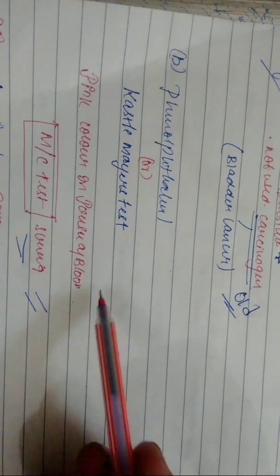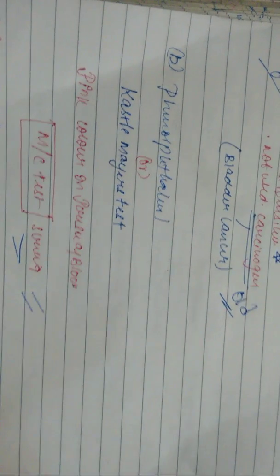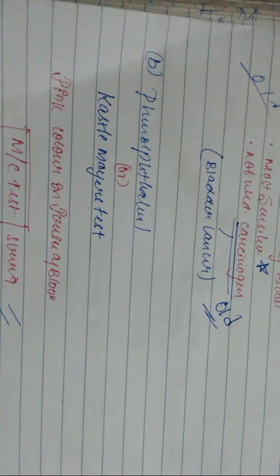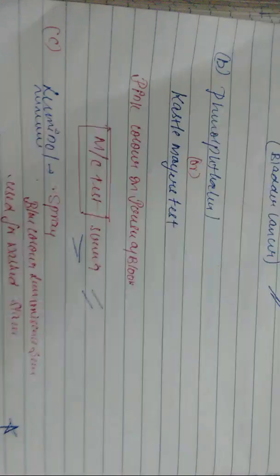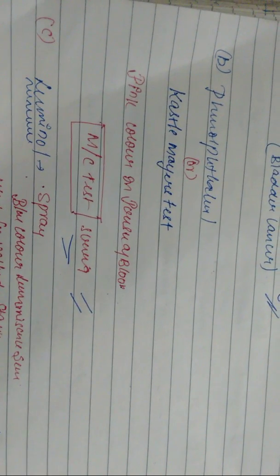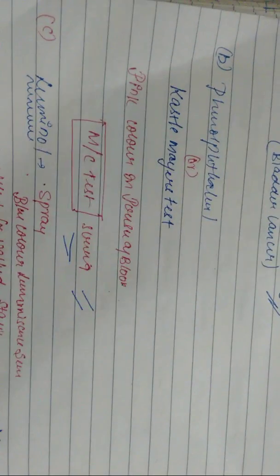And the next thing you have to understand is the next test, and you have to remember that this is most commonly used, right? Most commonly used. So this is the second test. The next test written in our notes is the luminol test, right? What is this luminol test?